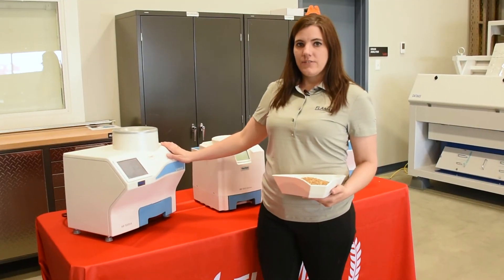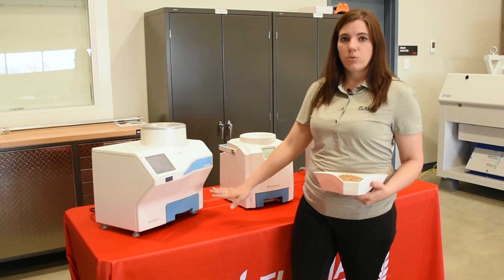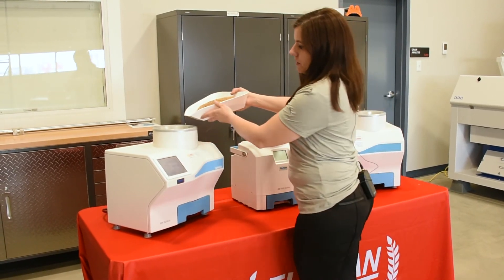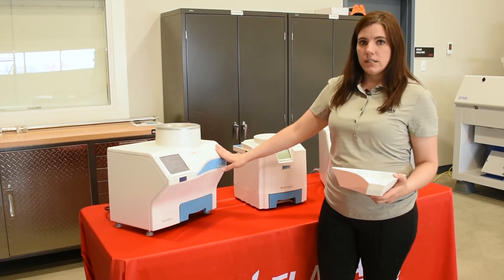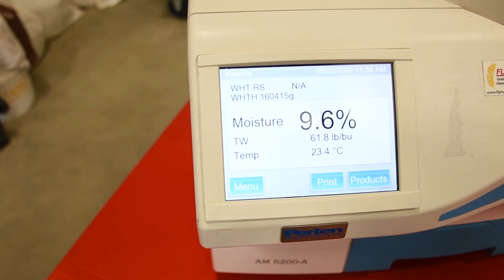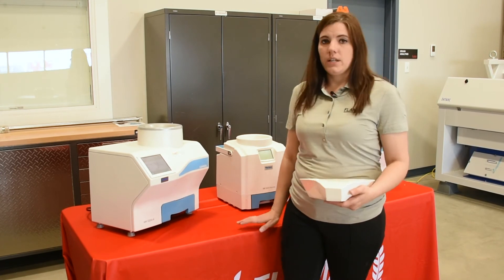The 5200A is very similar to the 5200 farm — it has the same construction. A few extra features on this one: you can have a flow-through on it and you can hook up an external printer to it. You select the grain you're going to test and pour the sample in the top. This one will automatically detect and do the sample, and it also displays moisture, bushel weight, and temperature. Both 5200 units can have calibration changes or updates done by a USB stick, and they're quite easy to do.